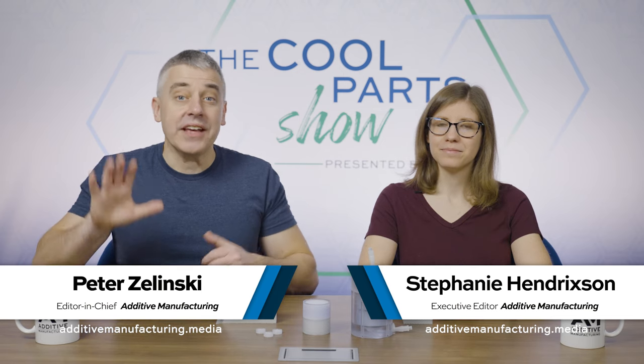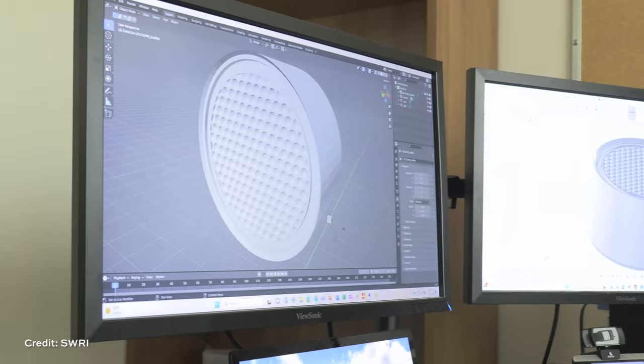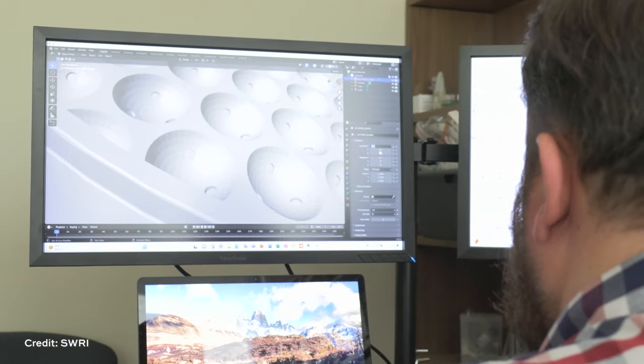You know about 3D printing as a solution for complex geometry. Getting the surface area needed to grow a billion cells within a tight volume requires a geometry that pushes the limits of the 3D printer and software. 3D printed scaffolds for bioreactors in regenerative medicine on this episode of The Cool Part Show.